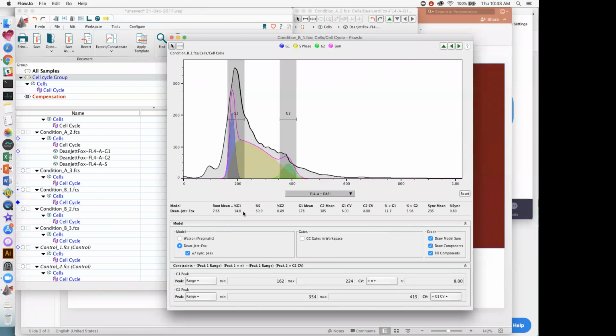For example, here again, we're falling short of that 100% easily within the first three phases. I hope that answers your question. I know it's not the clearest answer, but if you want, you can send me your email, and I'll try to get you a more formalized technical answer from the engineers at headquarters.